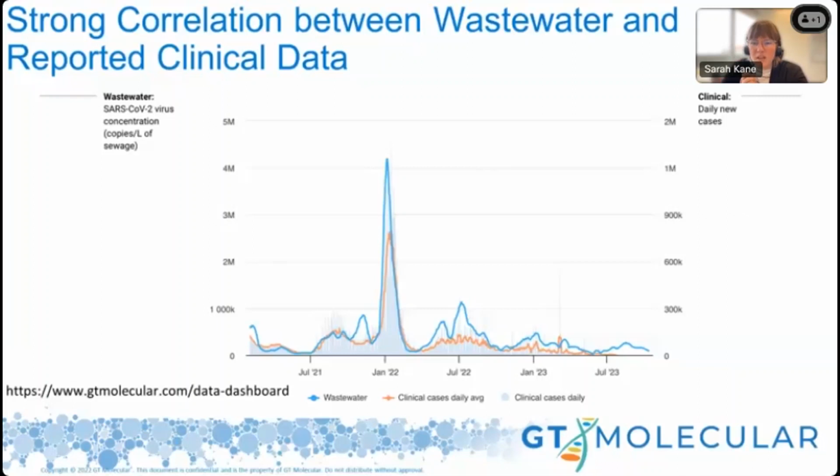Okay, so then Kyle asked, how did we come to use the Bio-Rad QX600 versus other digital PCR machines? And did we notice any issues optimizing assays to eliminate rain? So our internal testing service has always used the Bio-Rad QX200 platform, and we've worked with Bio-Rad since the beginning. Even before we got into wastewater testing, we were using the Bio-Rad system.